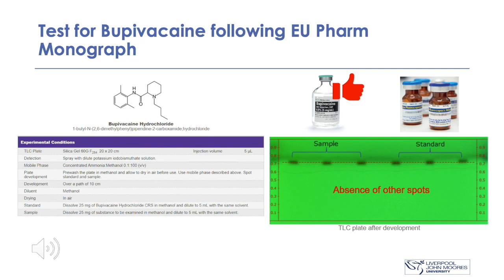You can see that at the extremes of the plate by the sides, the spots go a little bit further. This is usual in TLC because towards the sides of the plate, the solvent makes like a U. And in the middle of the plate the solvent front is more linear and stable.